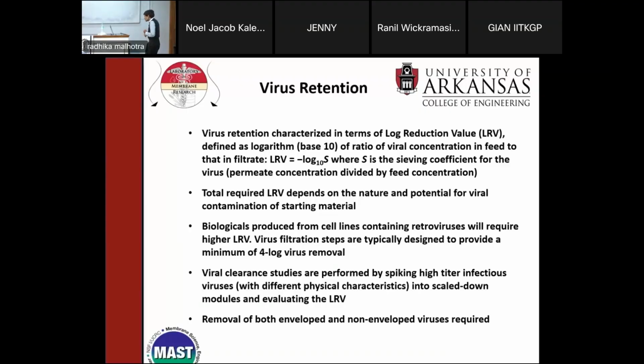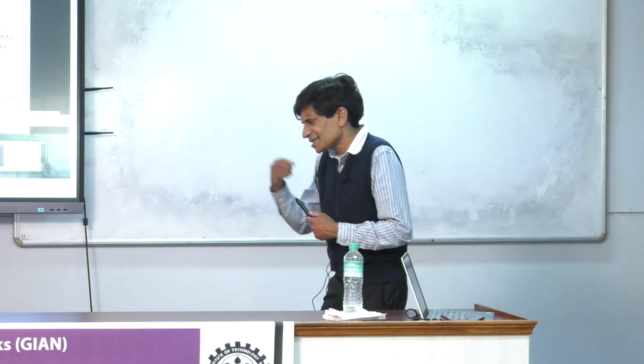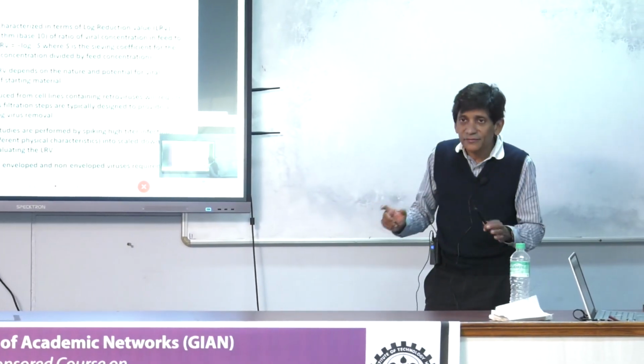But you could imagine that an infectivity assay is costly and very time-consuming because you have to grow these cells, you have to conduct the infection, you typically do lots of dilutions, and you get to the point where there's no more infection, and then you can determine the number of virus particles you have. So, and it's a statistical method. That is ultimately you have to do that.